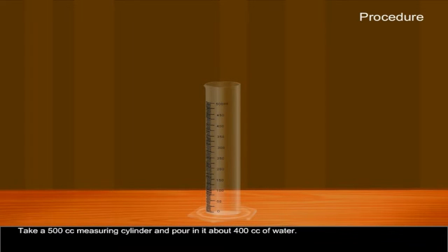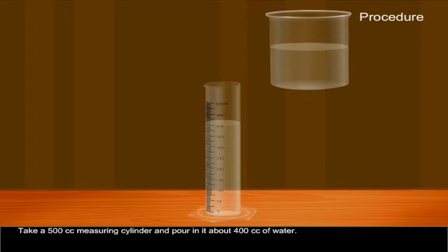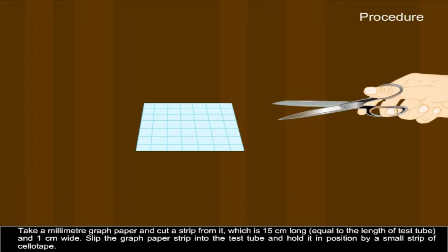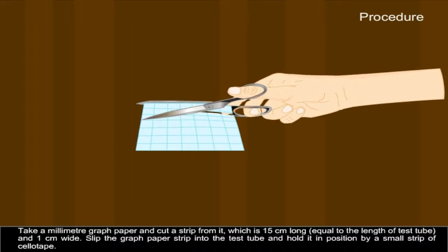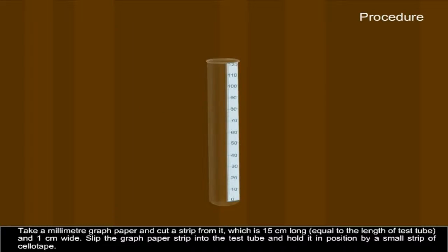Procedure. Take a 500 cc measuring cylinder and pour in it about 400 cc of water. Take a millimeter graph paper and cut a strip from it which is 15 cm long, equal to the length of the test tube, and 1 cm wide. Slip the graph paper strip into the test tube and hold it in position with a small strip of sellotape.